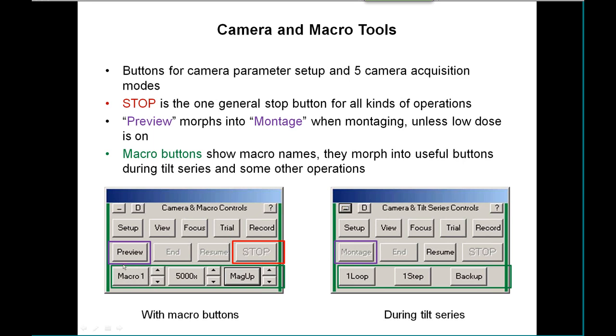You can dial up which one is shown here, or you can have a toolbar that shows them all. If there's a name defined in the macro, it will show up in the button. These buttons get hijacked and turned into other things during tilt series and a few other operations.